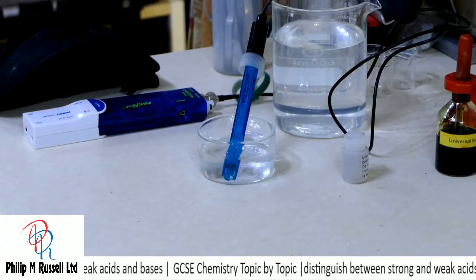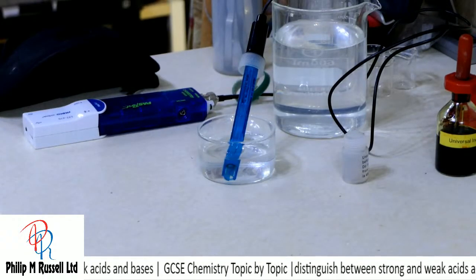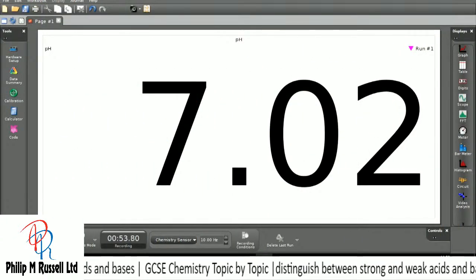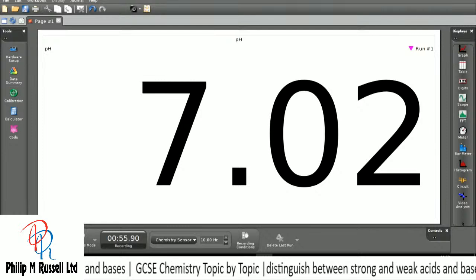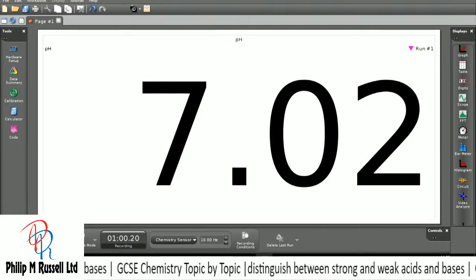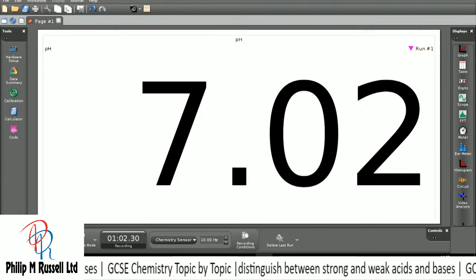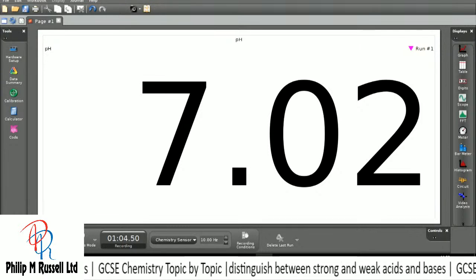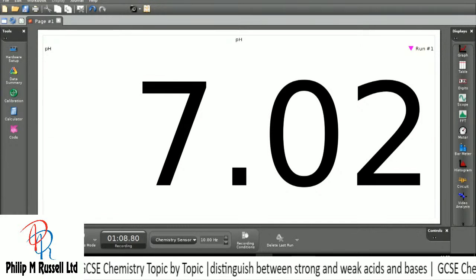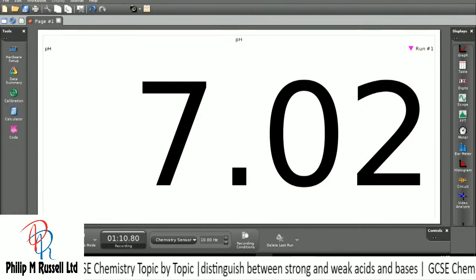And if we have a look at this, we should see a pH of, oh dear, not quite right. There we are, 7.02. It's not quite right, is it? My water wasn't quite 7. I'm very sorry about that one. I am just dealing with real life situations.